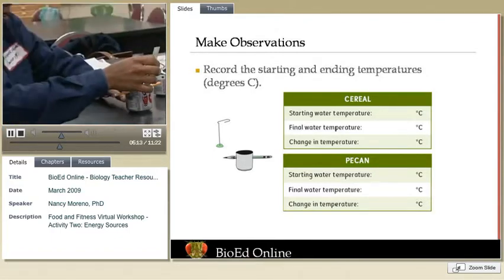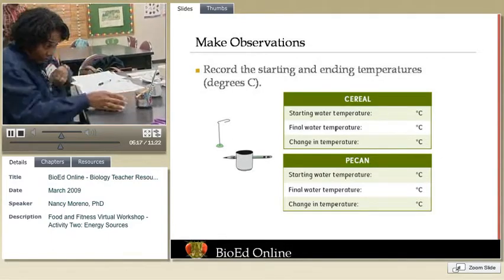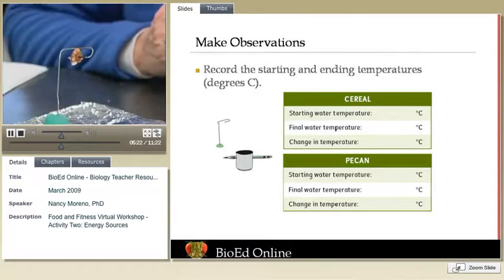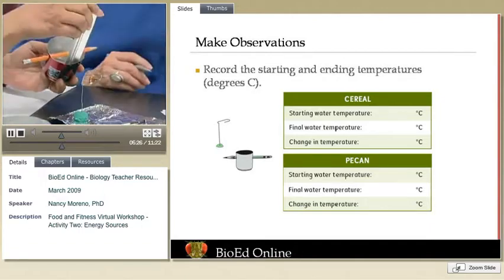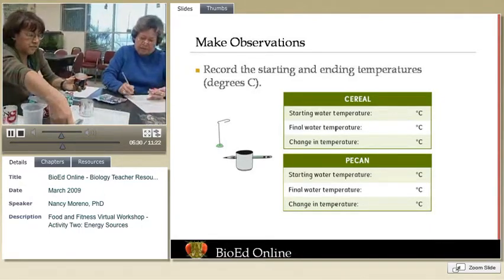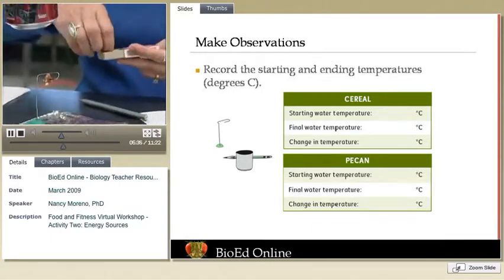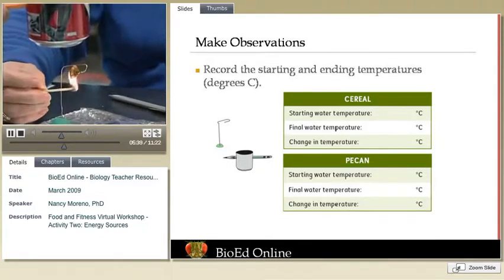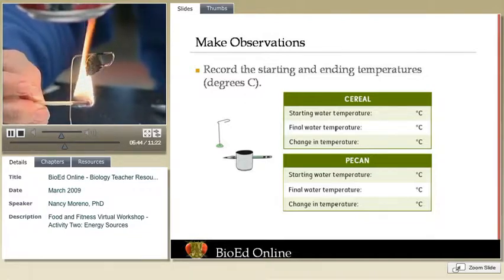But when we're watching it, the water is right at the end of the flame. It's going in. How do you read the initial? 25? 25, 26? We'll say 26. Okay. Now, here it goes. And we wait for the flame to go as high as possible, and we keep the water about 1 inch at the end of the flame.